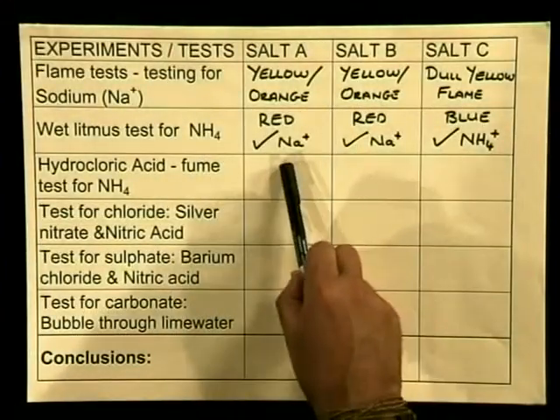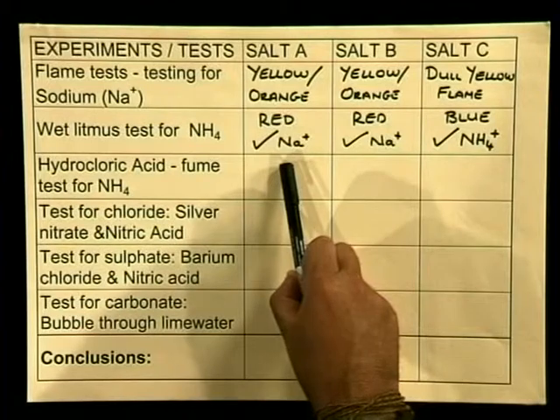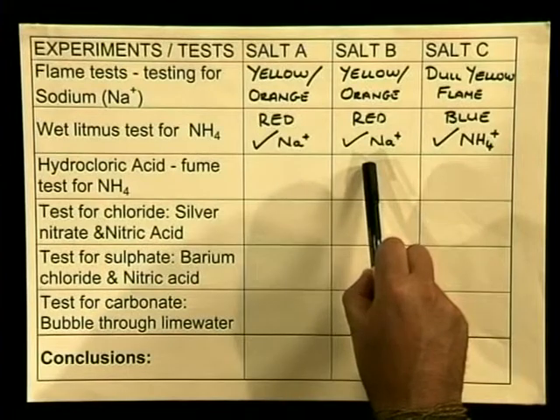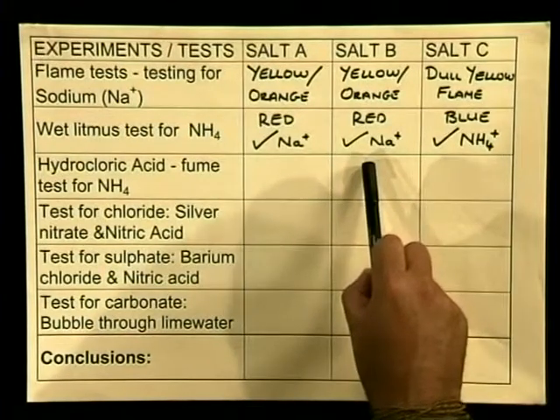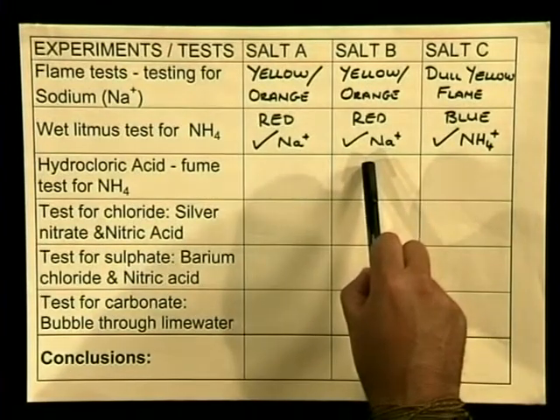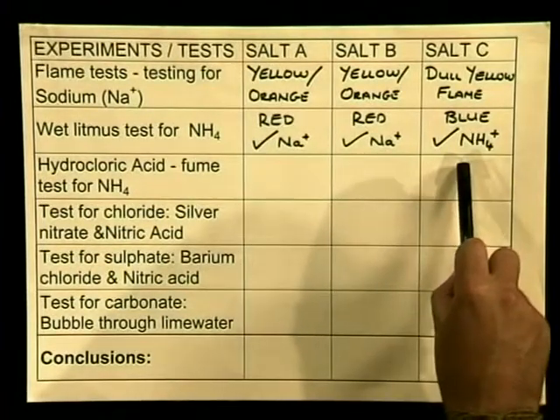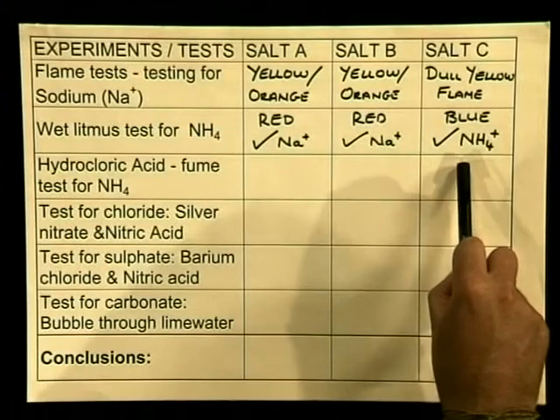In test tube A the litmus stays red, so it must definitely be the sodium cation. In test tube B the litmus remains red as well — definitely the sodium cation. While in test tube C the litmus turns blue, which confirms the presence of the ammonium cation. We can confidently say that A and B are our sodium salts and C is our ammonium salt. We have successfully identified the cations in our unidentified floating objects.